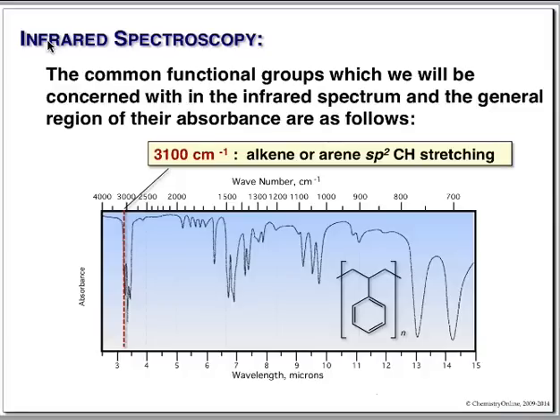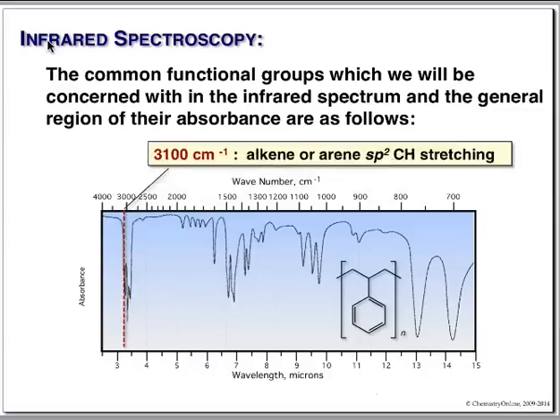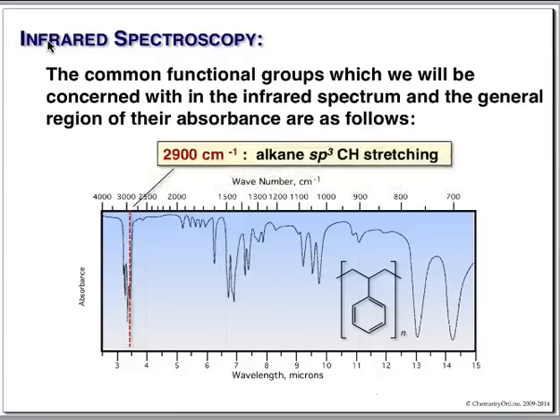At the high end of that is where we're going to see sp2 CH. And as we saw, when you get below 3000, this is where we get the sp3 CH. So for the sp2, going back one, 3100 or so, we do have a nice peak. And that's consistent with the CHs on the ring. Again, these are the asymmetric and symmetric CHs from the top part of the polymer.